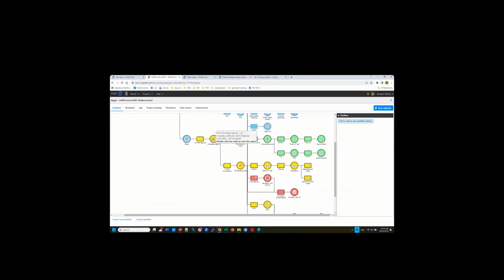Here, I want to introduce another normalization method. For RNA-seq, we just use log CPM, but for ATAC-seq, in this industry we follow the Signac pipeline, and they recommend TF-IDF normalization.